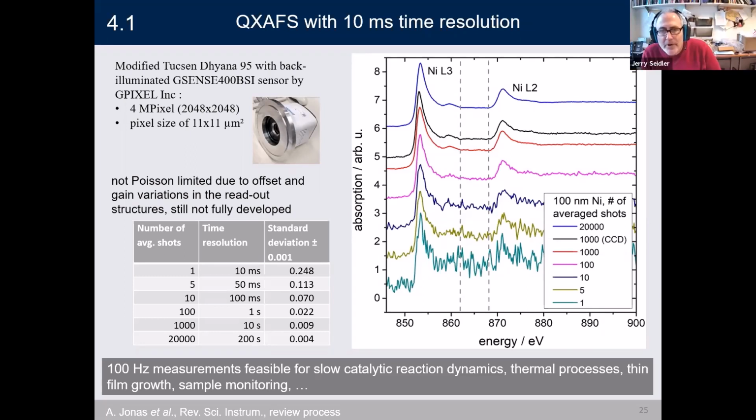Of course. I wanted to point out that I think Oxford has a new soft X-ray CMOS camera that they just released the specifications on last week or 2 weeks ago. You might take a look at that, or you can email me and I'll tell you. I've forgotten the brand name. But there's at least one other soft X-ray CMOS camera that's becoming available. Yeah, they're starting. I think Andor is also starting. So it's really a very rapidly changing field, I think. Yes. What cameras are available, that's really nice.